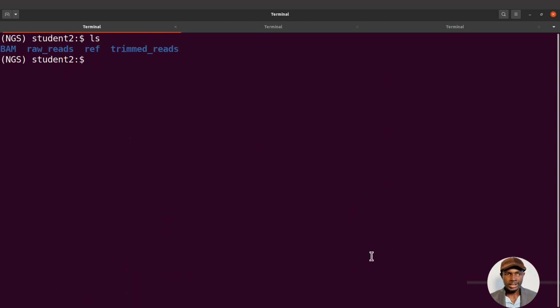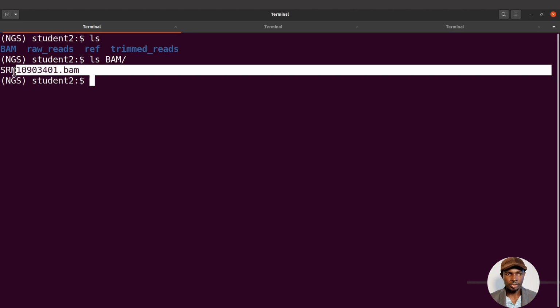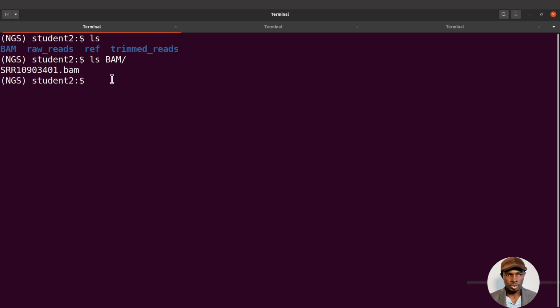Let's do an ls. We'll find our BAM directory. So let's ls into it. And we are going to find our BAM file. All right. So now we can proceed.